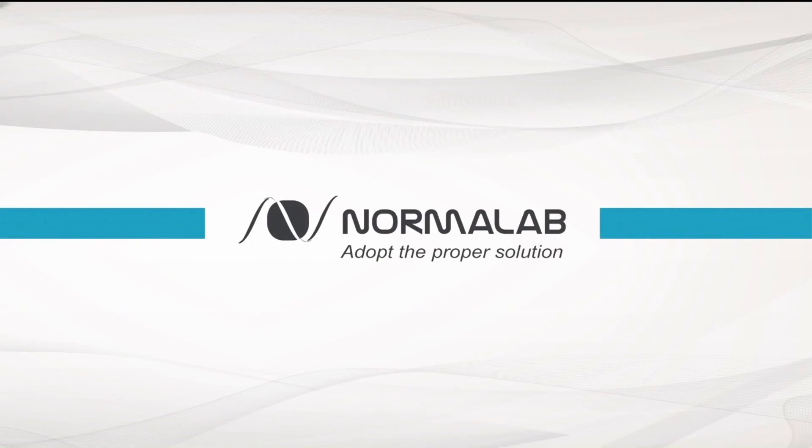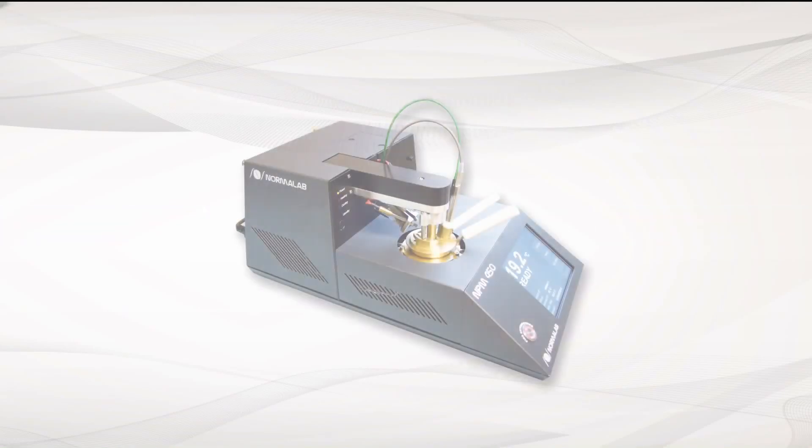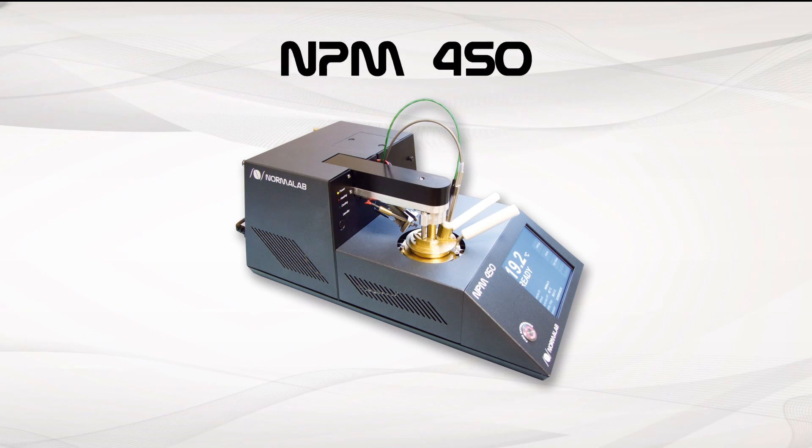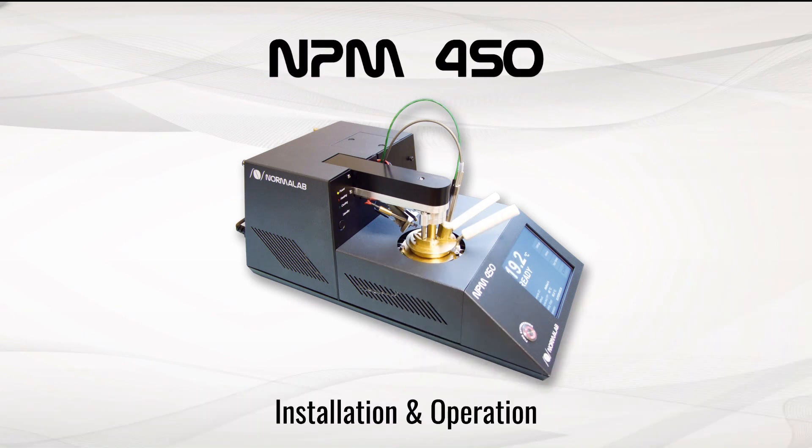NormaLab adopts the proper solution. NPM 450 installation and operation.